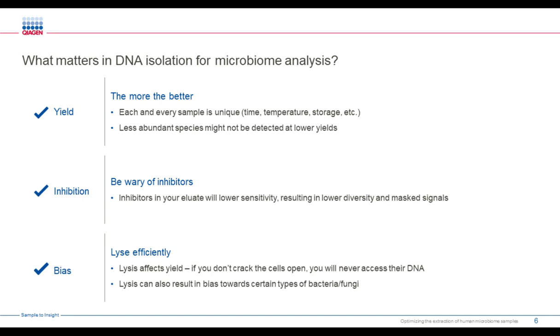So the question is, what really matters when you're trying to do DNA isolation for microbiome analysis? And of course, the first point is that yield is critical. The more that you can get out of your sample, the more analysis that you can do, the higher chance you have of detecting low abundant species, and you can just simply be more confident in your results if you really know that you're extracting all the DNA that's present in your sample.